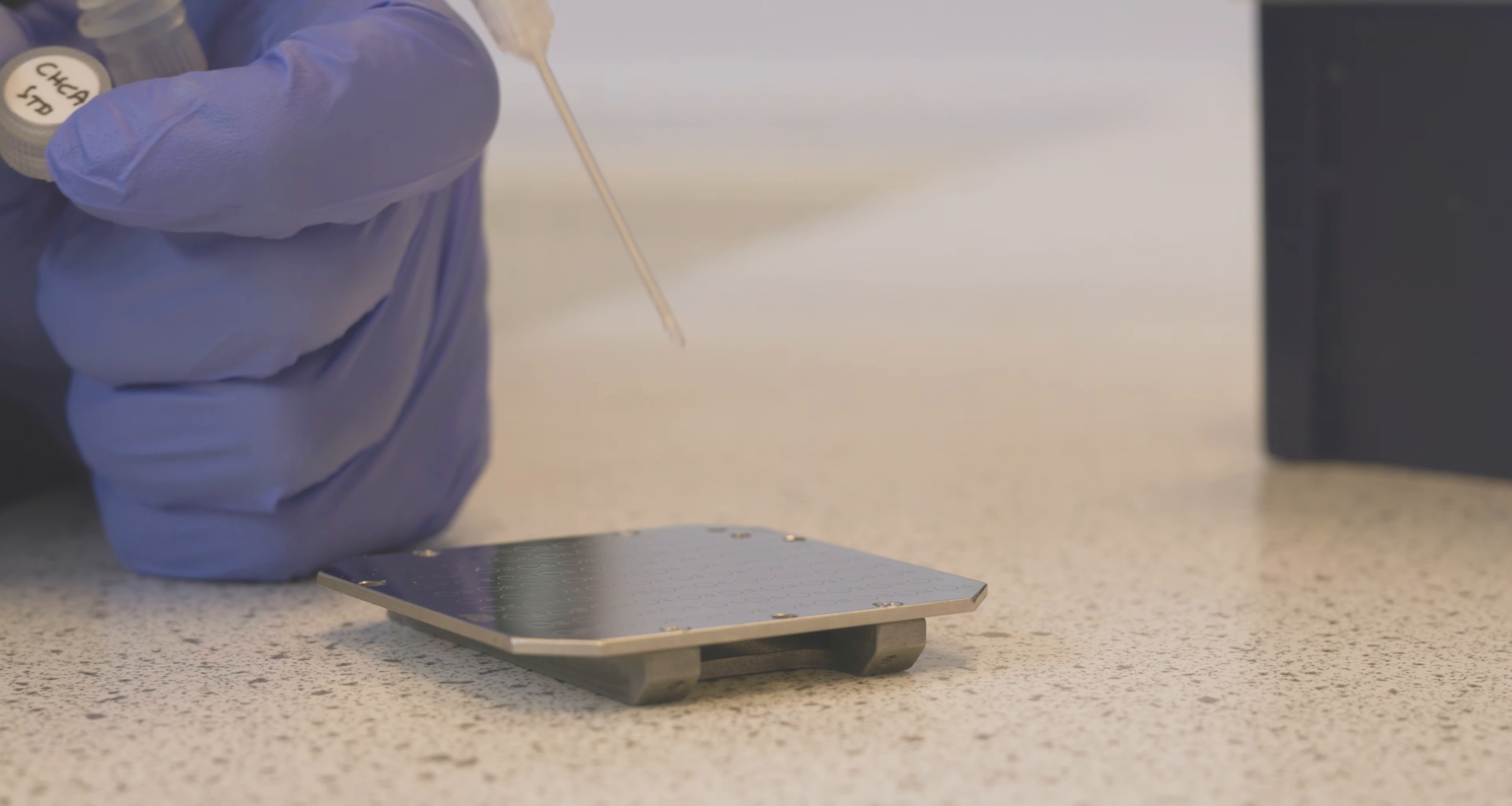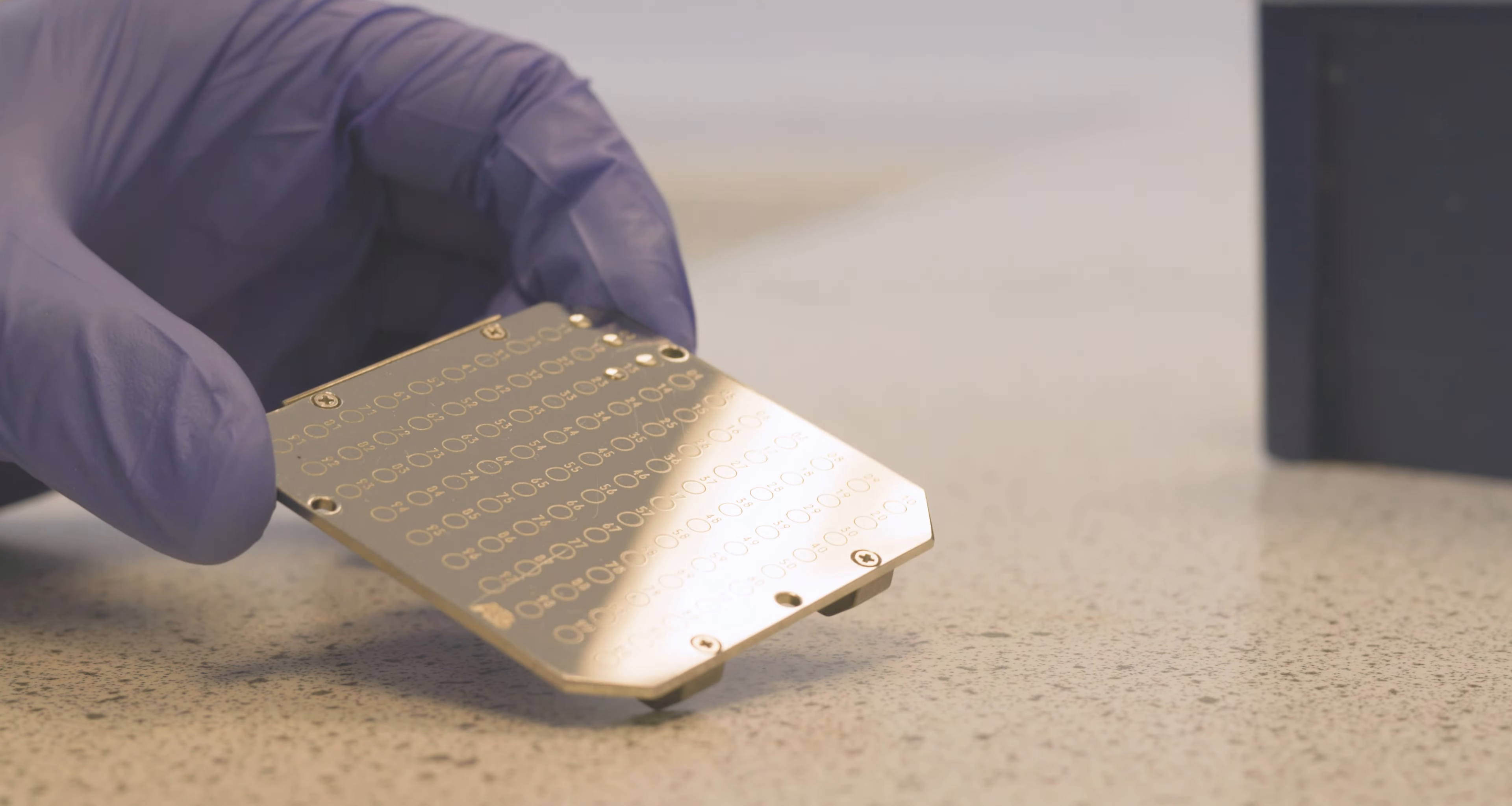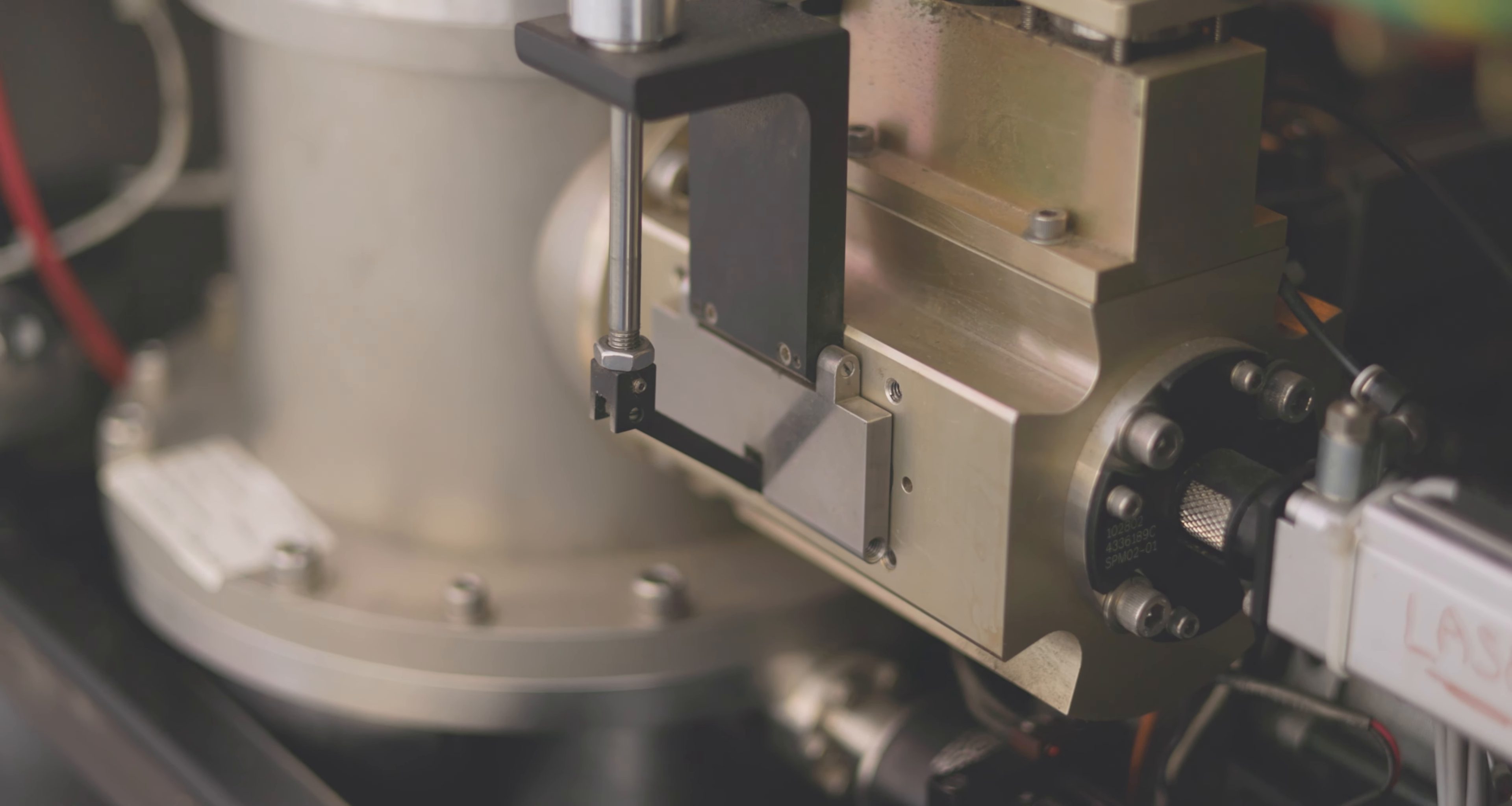On one of these sample plates, we dot our sample onto the little circles. In this case we're dotting four of the same sample, and now this is ready for insertion into the machine.